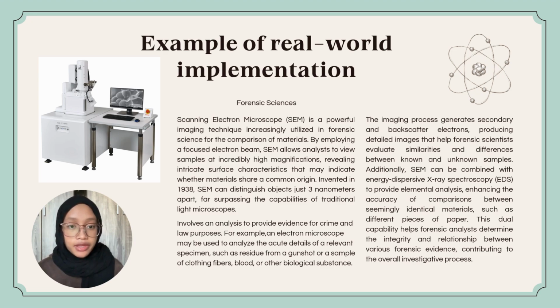Additionally, SEM can be combined with energy dispersive X-ray spectroscopy to provide elemental analysis, enhancing the accuracy of comparisons between seemingly identical materials such as different pieces of paper. These dual capabilities help forensic analysts determine the integrity and relationship between various forensic evidence, contributing to the overall investigative process.